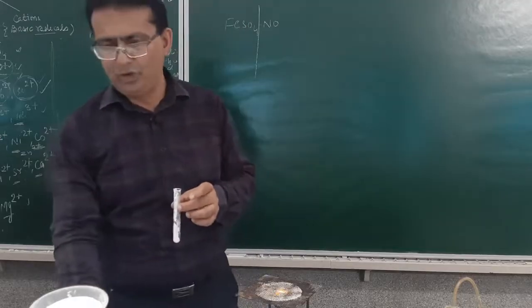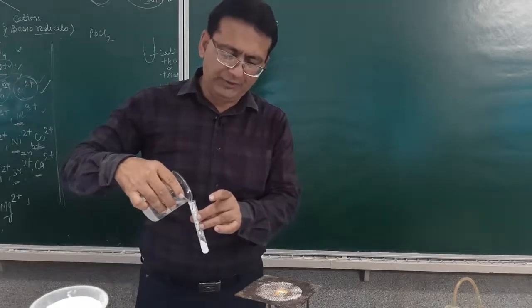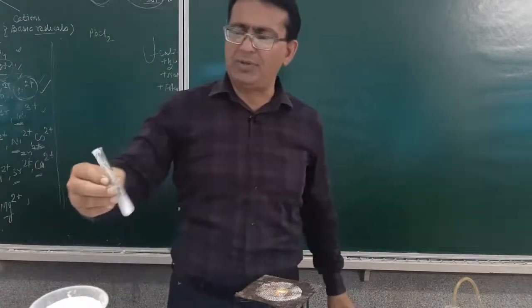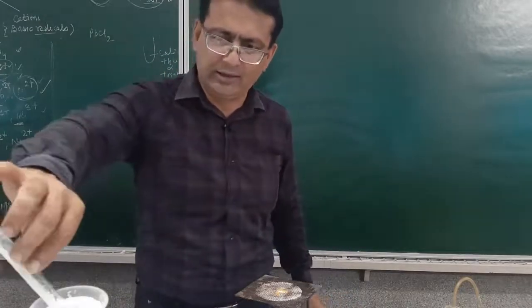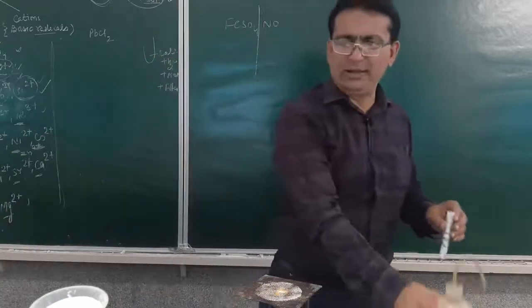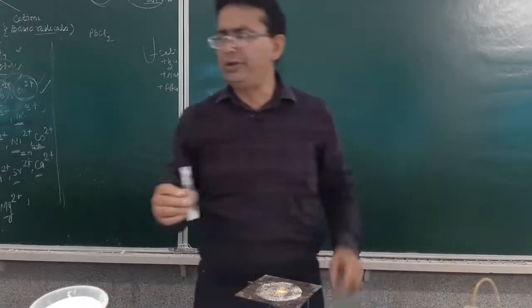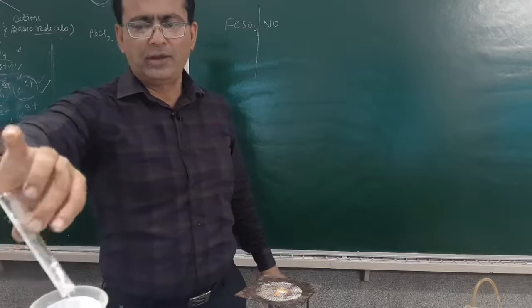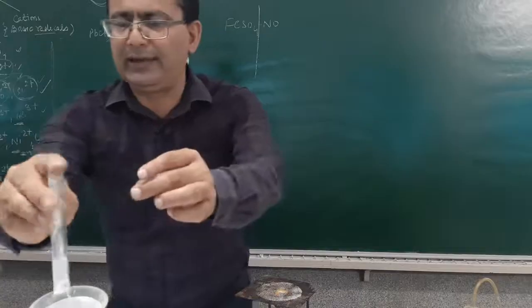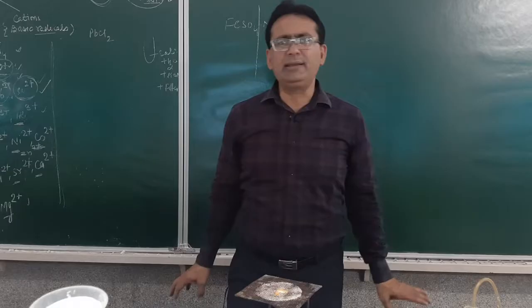Am I getting it clear? The filtrate will be kept for the second group. If the first group is present, you need not go into the second group, but in the examination you may be asked to at least write down the analytical table, so that can be done there. Is it clear? You may see it has started filtering up. Can you see that? Now, once you filter this, collect the residue. You have to collect the residue for the analysis of the cation.